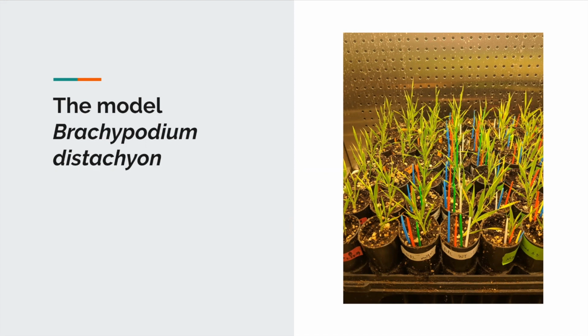There are few ethical issues and regulations surrounding research with plants, so it was easier for us to work with this organism. And then it was simple to store, and there wasn't a lot of training involved in working with this organism. So there wasn't any kind of special assistance we needed. When we needed to harvest a sample, you could just go in and take a clipping with scissors, and that was really all you needed to do.